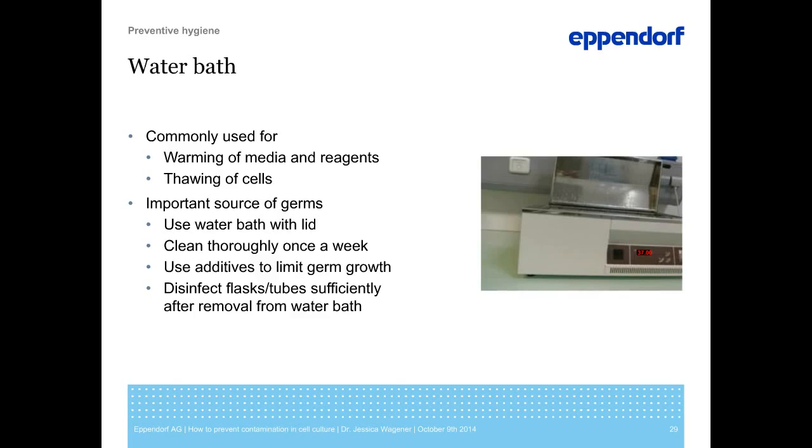When you remove the vessels from the water bath, make sure that you disinfect them properly before placing them in the BSC. Pay special attention to the cap area when disinfecting, because this is the place where germs can hide.